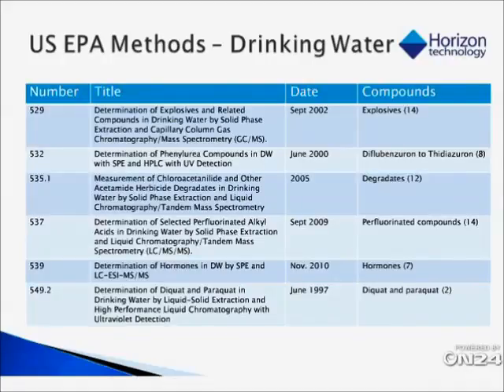Now, in terms of solid waste, the Office of Solid Waste, most of their methodology is guidance only, and any time that you can meet the quality control criteria and meet the data objectives, then your technique would be allowed. And solid phase extraction, we have demonstrated, certainly fits with that. Now, on your resource tab, there is an application note showing method 8270 in detail. What we talk about here is just an overview, but you can look at that application note for the details on the performance.